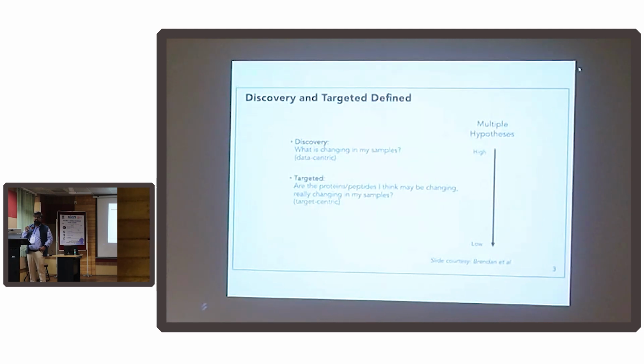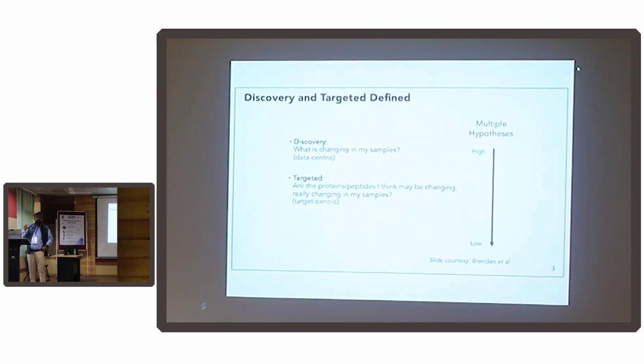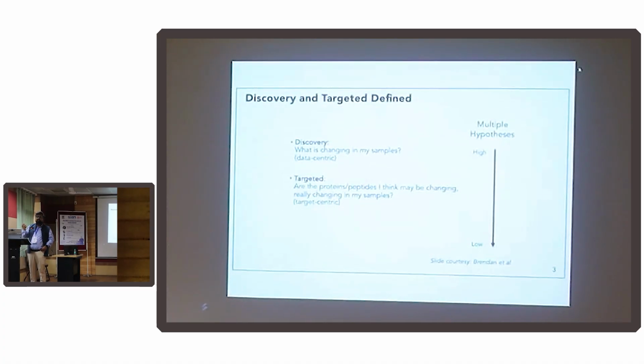You want to design an assay to detect whether a particular person has a viral infection, right? One way, always, we have the RT-PCR. What if you can detect viral peptides in their blood, or a malarial parasite peptide in their blood? So once the peptide is present, it's more like an ELISA or Western. Only this time you can upscale it.